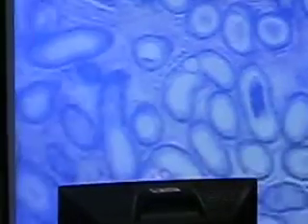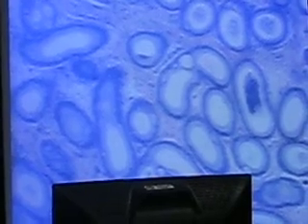Are those cuboidal? There's really no distinguishment because it's not epithelial tissue per se. But yeah, if you look at them, you'll see some cuboidal, you'll see some squamous. Again, there's connective tissue in there as well. So there's really no identification as far as the specific shape of the cells. Because these are not epithelial linings. These are all inside. And then the epididymal ducts lead to the ductus deferens.